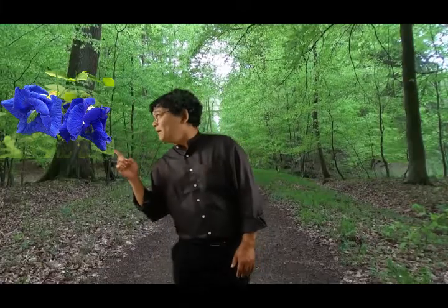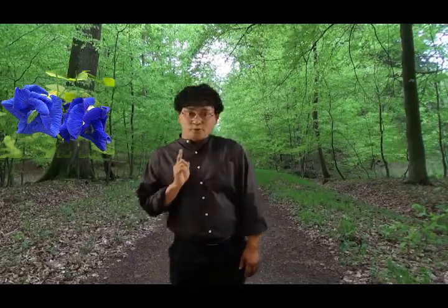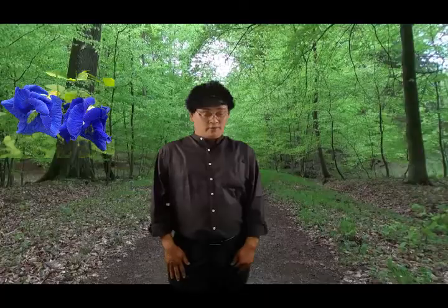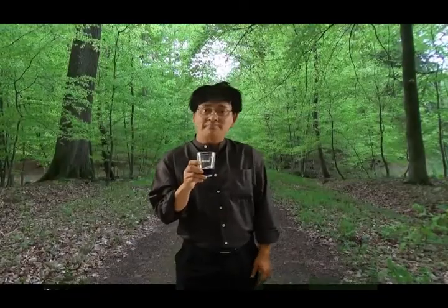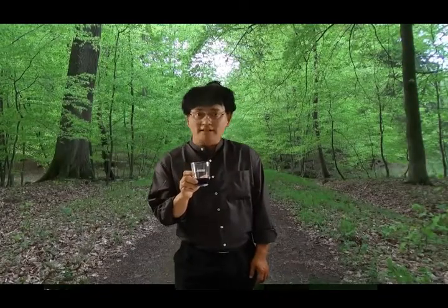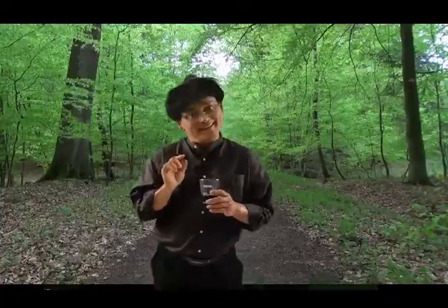This is a blue pea flower. We use the blue pea flower to make nasi kerabu. The most interesting part of this blue pea water is it can change color. Let's do some magic!